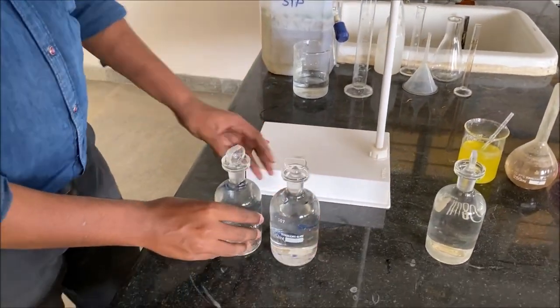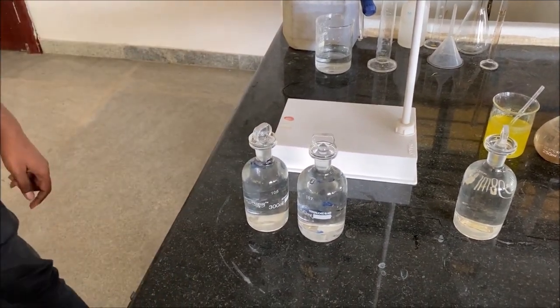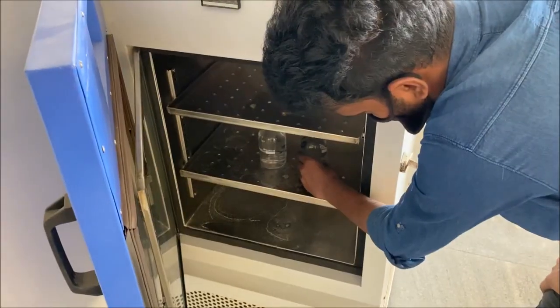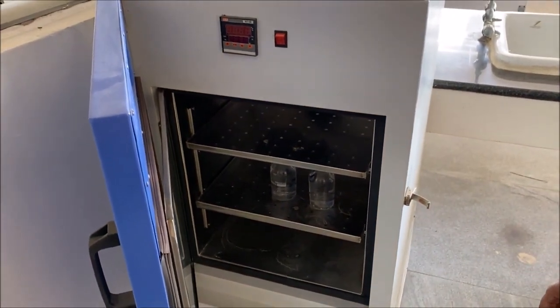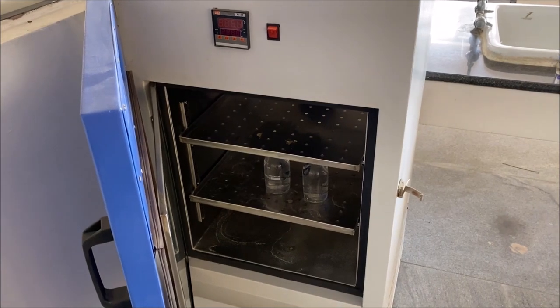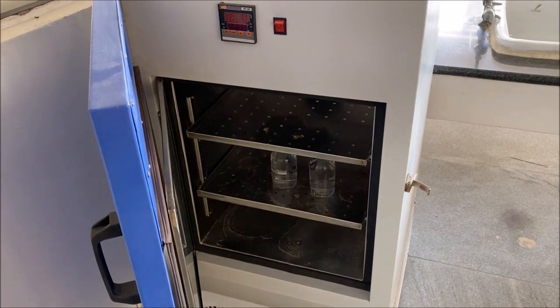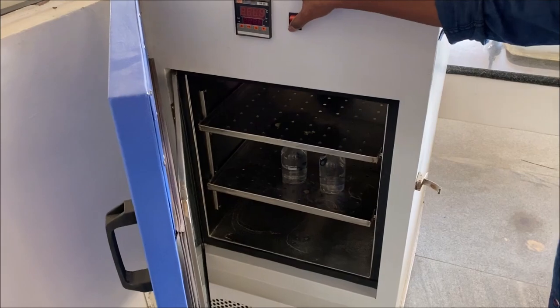Both the BOD bottles, which are completely filled with dilution water, are placed in the thermal chamber and a temperature of 20 degrees Celsius is maintained for a period of 5 days. And then the 2 BOD bottles are removed from the chamber and the determination of DO is carried out for the 2 samples from the 2 BOD bottles, which are kept in the thermal chamber right now.